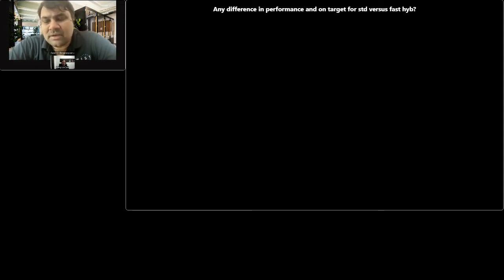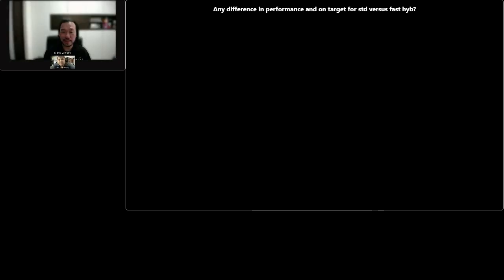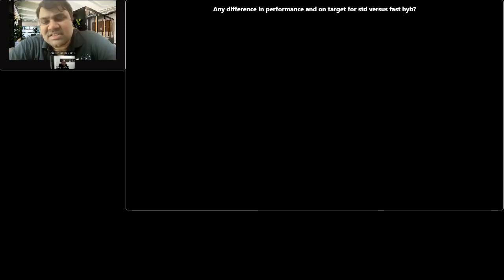And sometimes it's better with fast hyb. And I believe we have the protocol for both the standard hyb and the fast hyb, correct? Yes. The fast hyb protocol is the same; we haven't changed anything in it. But the new and updated protocols for the standard V2 are already on our website, or feel free to reach out to me and I can share them ASAP.